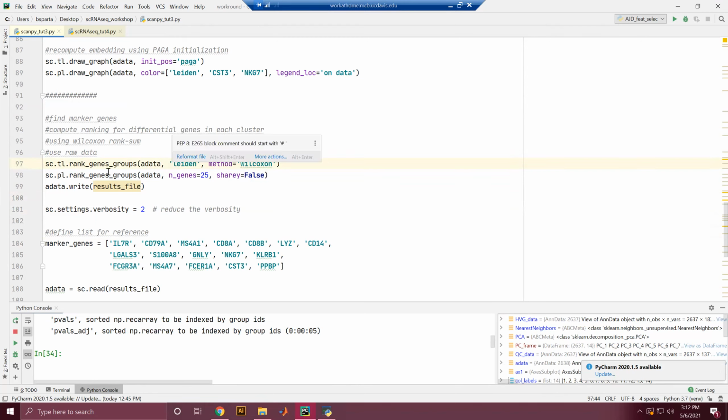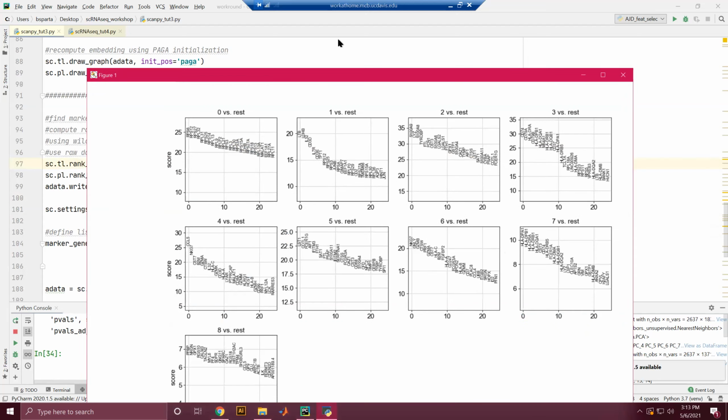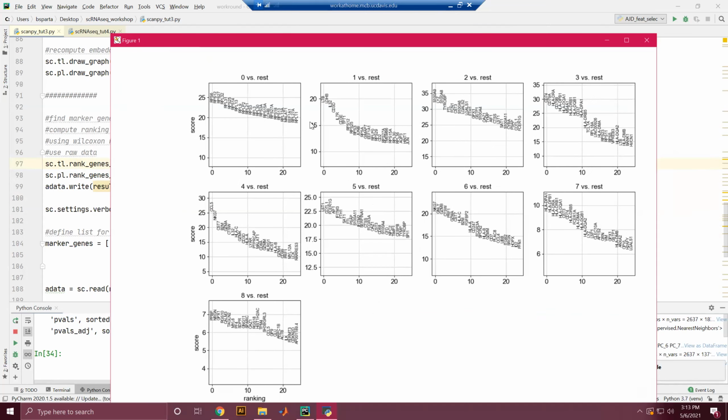test. And then this second graph here is just the plotting module that will show us the 25 most differentially expressed genes across our 9 cell type groups. And I don't know who made this decision, but again, we're plotting the names of the genes as the data labels, in order of the most significantly differentially expressed to the least.